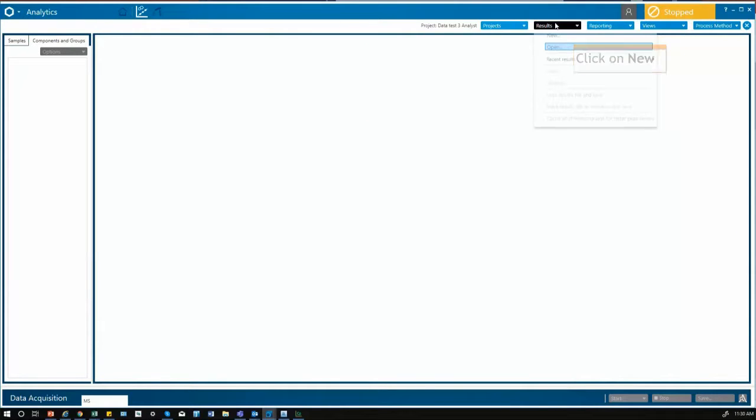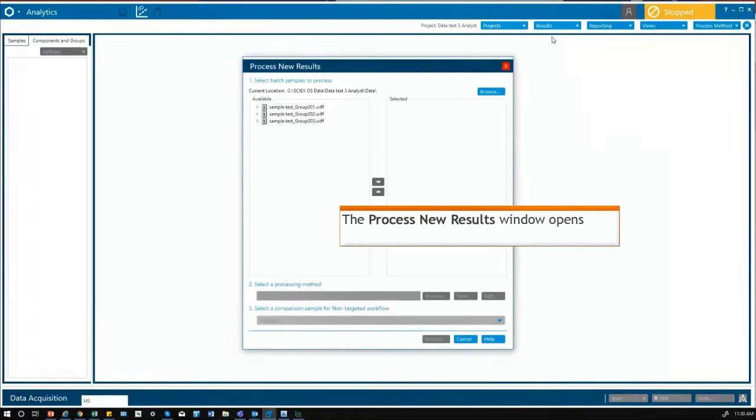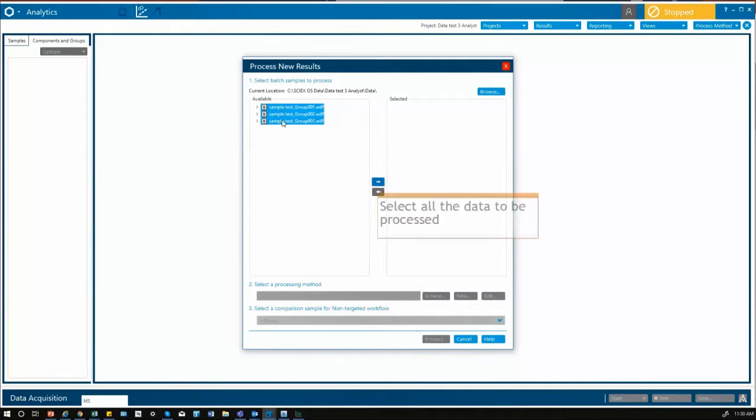We start as normal and select the samples that you want to process. In this case we have three groups of data that have been processed in DiscoveryQuant and contain different analytes.